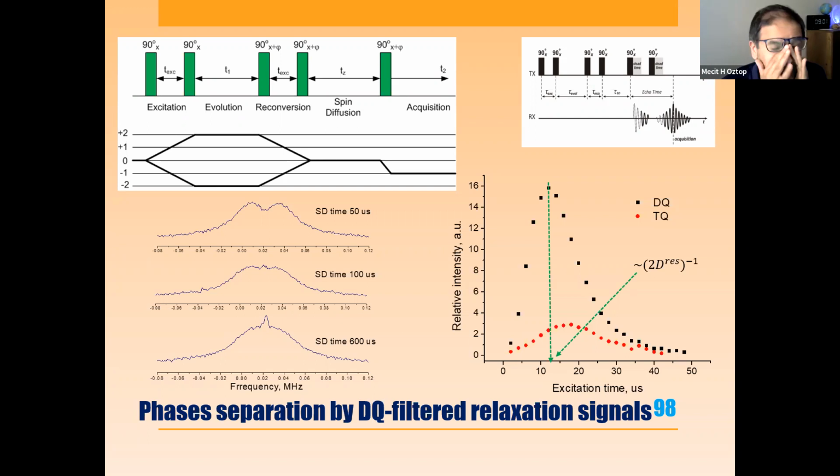Dr. GRUNIN, I have a question. Can we use this filtering also for samples like honey, which is really viscous, but we are interested in, let's say, crystals? In case you have anything rigid, maybe 5% of rigid fast component, you can implement it and kill all other signal. If it's really small, you won't kill it completely. You can use 8 or 16 steps in phase cycling to kill it better, but it's possible.